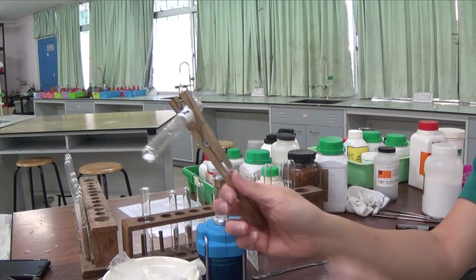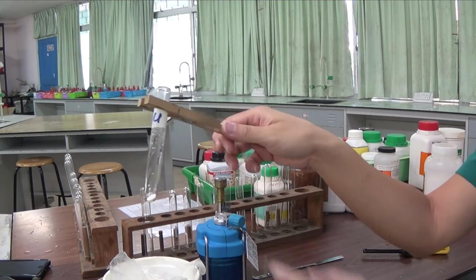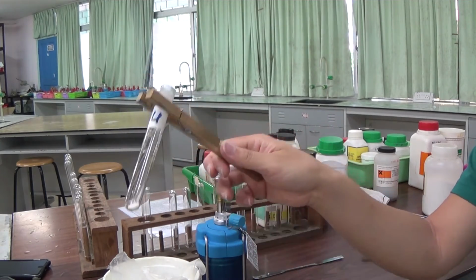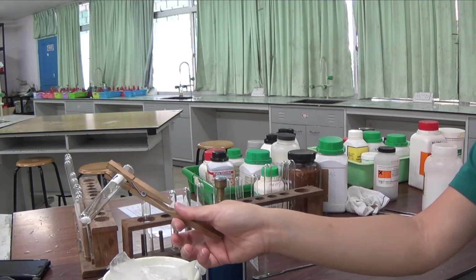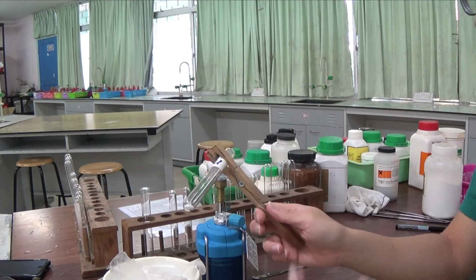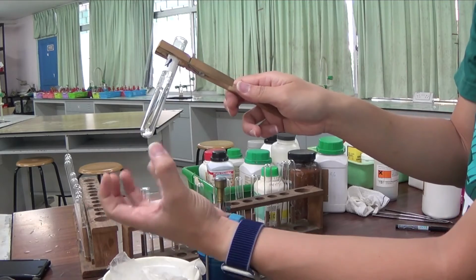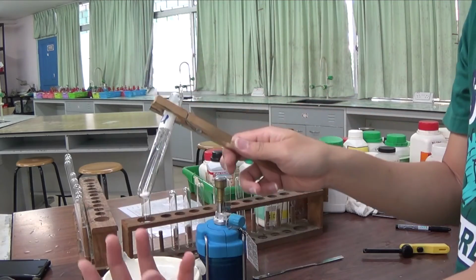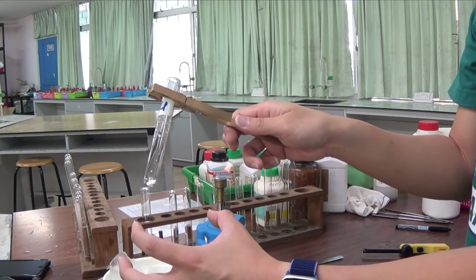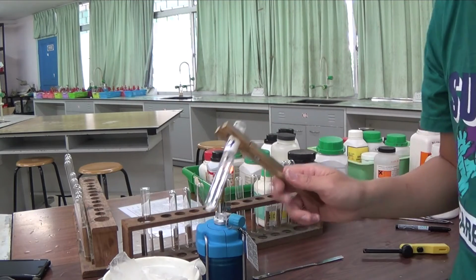So you need the mass of the test tube and the solid before you heat it, and then you need the mass of the test tube with the solid after you heat it, after you get rid of all the water of crystallization. Put it on top of the mass balance. But this is a test tube, it can roll. So you can use a beaker to support the test tube. So it's a beaker plus the test tube with the solid before heating, and then the beaker plus the test tube and the solid after you heat it, and that has to be to constant mass.